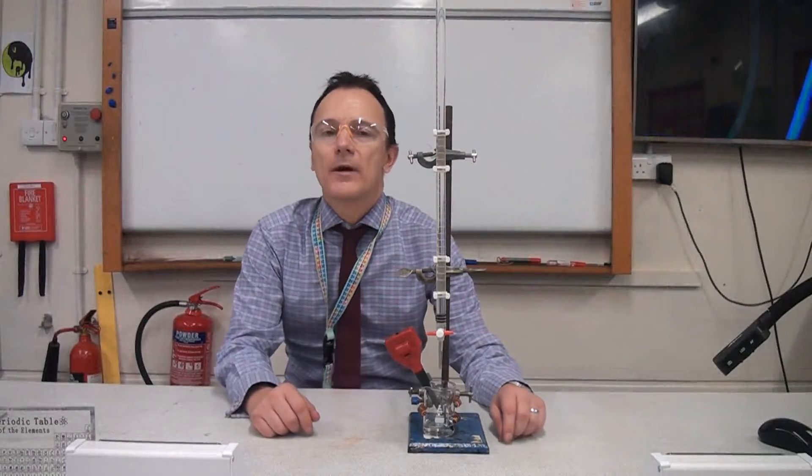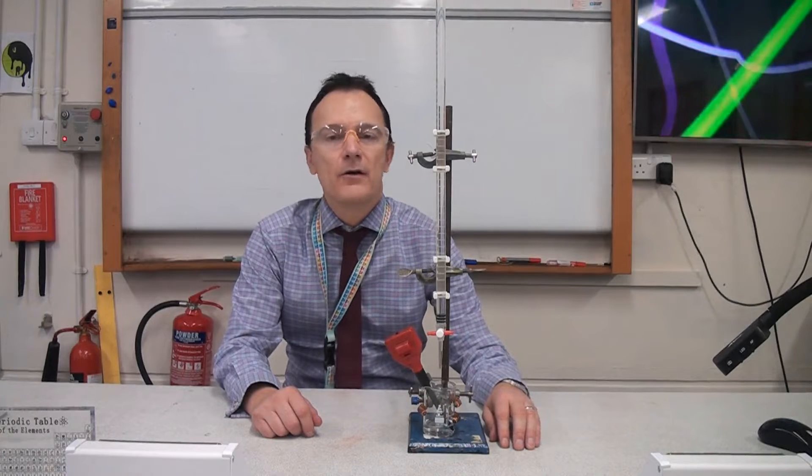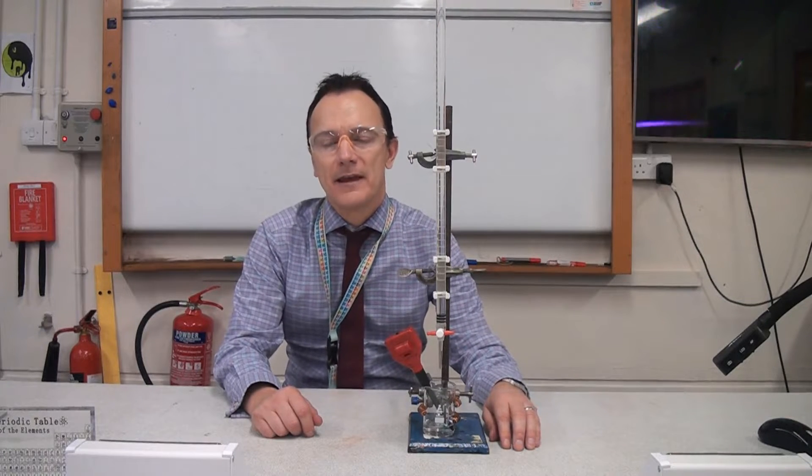Hi everyone, you might be wondering what I'm doing with this fancy equipment. Well, as well as showing you this, I'm also going to tell you what you could be asked about on your exam in relation to this. So make sure you watch the whole video so you don't miss out on the important exam tips.